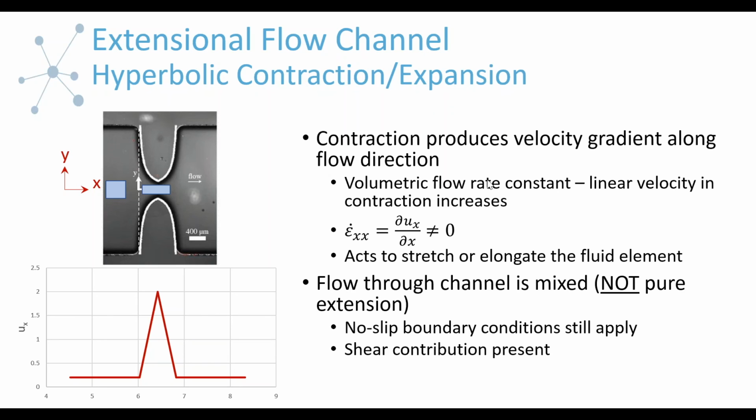Okay, so we have some questions also about choosing the specific parameters that we chose. And I actually don't have a good answer at the moment for the exact dimensions that were chosen. I think to some extent they were chosen because of the ability to place the sensors before and after the flow channel. But there's probably some details that I'm not aware of. So I can certainly look into that.